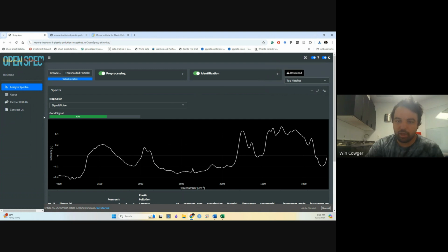Okay, we just have 2 minutes left. I'm going to stop again if anybody has any questions. I'll also stay on for a while if anybody wants to talk about anything specific. Thanks a lot for joining. I think the next call we'll be diving into this a little bit more in detail, probably using the R console to actually analyze some very large hyperspectral images, which once you get into like 100,000 spectra, it stops making sense to do it this way. It's not as easy to do it this way as it is through the R console. So we'll be using some code there.